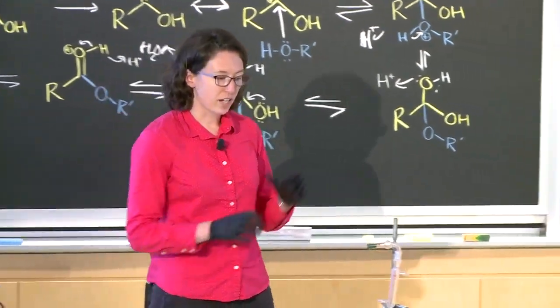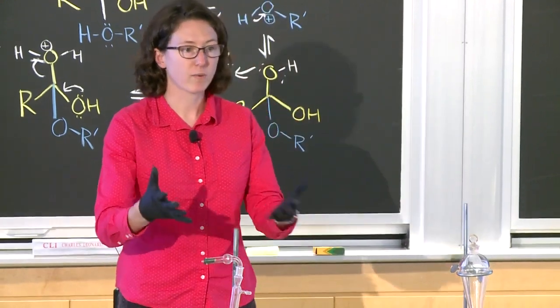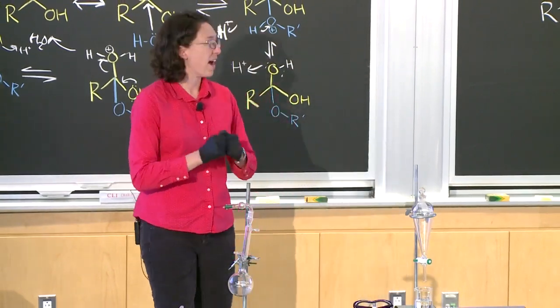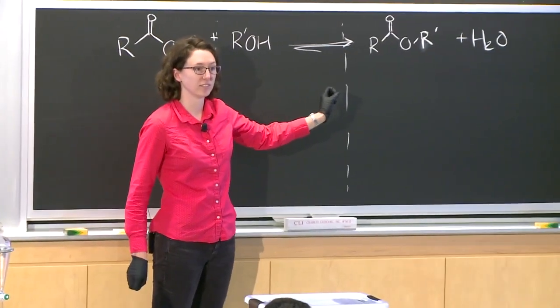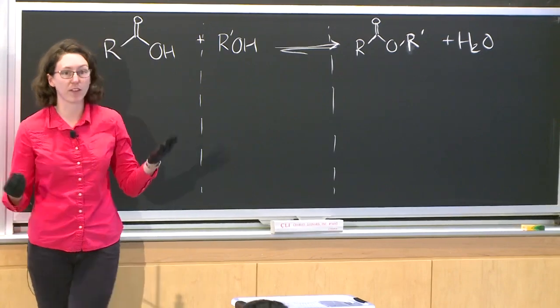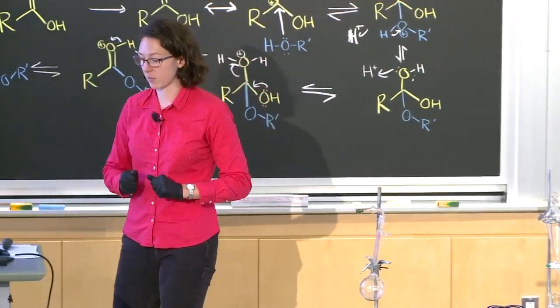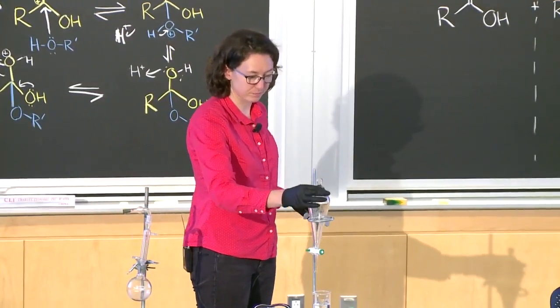So once you've done all of your reflux and you have your product, you've heated it for a while, it's kind of boring to watch, but reactions take time, then you will have your product in your round bottom flask here. And we will have our ester, hopefully, and what else? Potentially all of these things, right? And some sulfuric acid. So we don't know that our reaction went to completion. We hope that it got close, but we need to purify it from any impurities or remaining starting material that we may have. So we do that in a separatory funnel, and this is a separatory funnel.